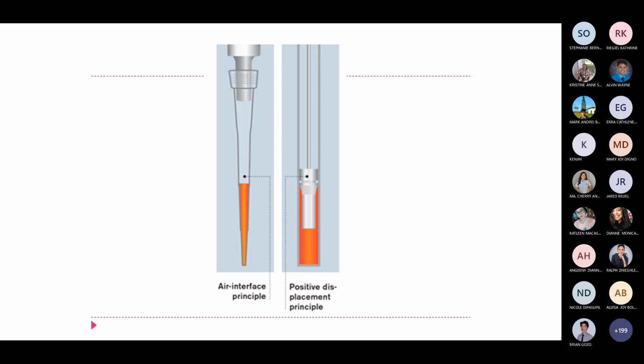Okay. Again, this is for air displacement, and this is for positive displacement pipette.